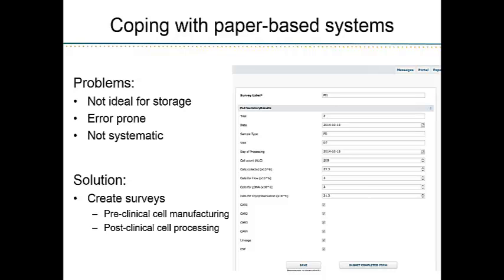This is just an example of what a correlative studies survey would look like. So we would have the patient information, everything in the server is de-identified. And then what actually happened with the cell processing that day. So how the cells get allocated and then what flow panels we run. And that would be just a very general survey that eventually I would like to make as well.